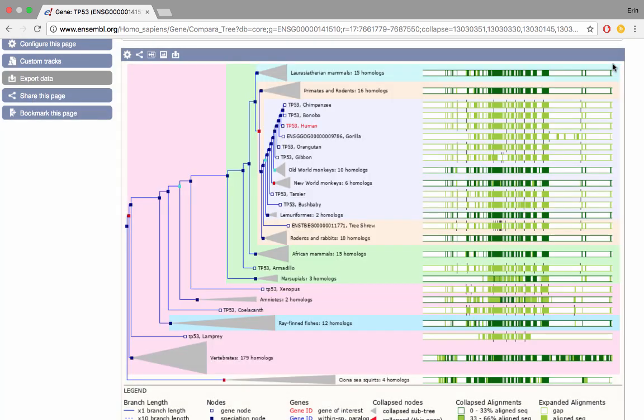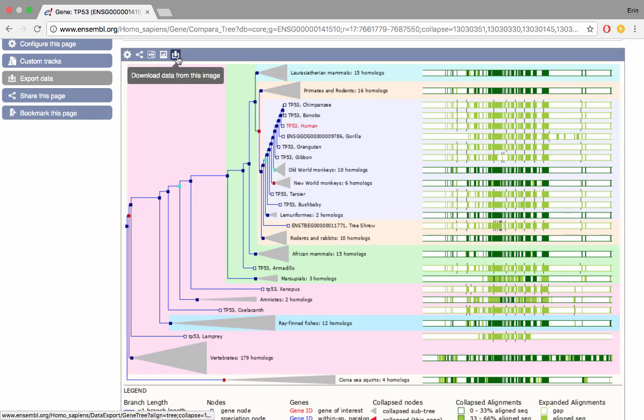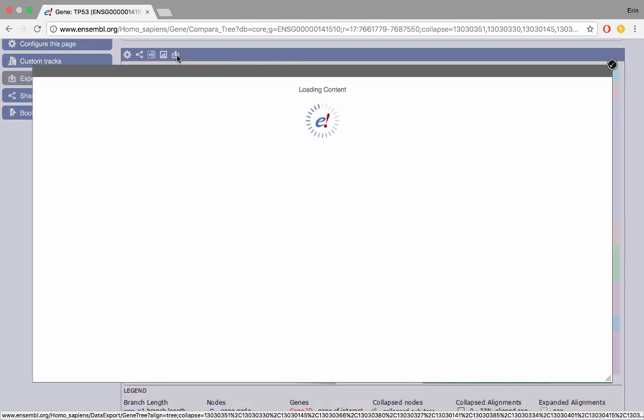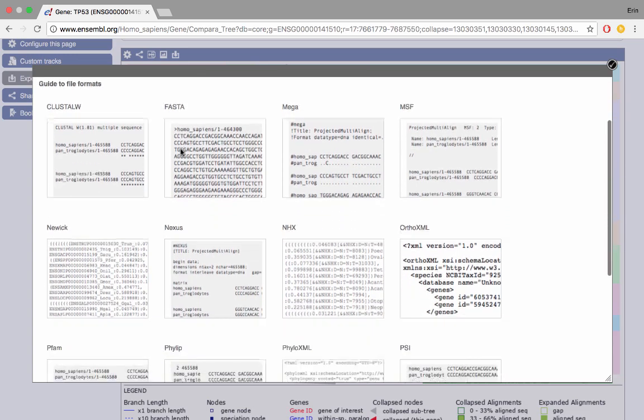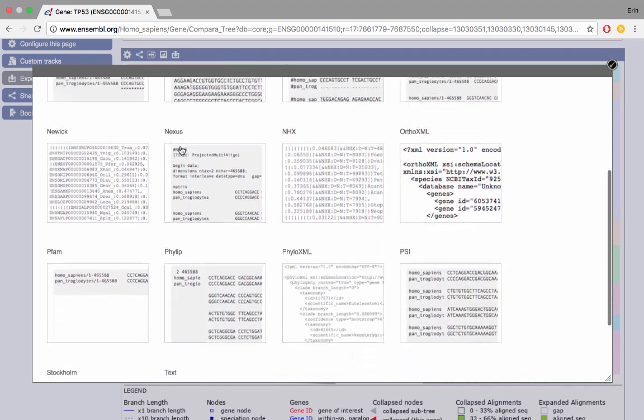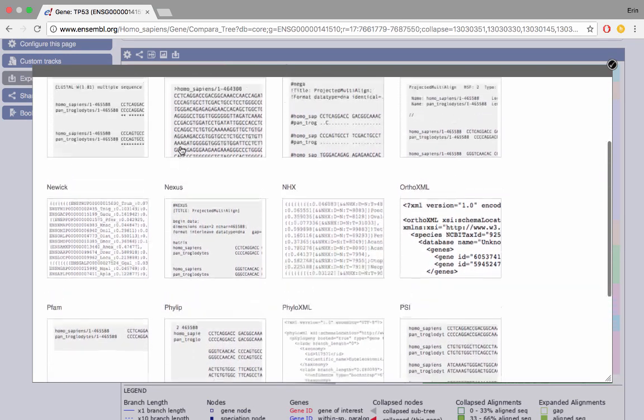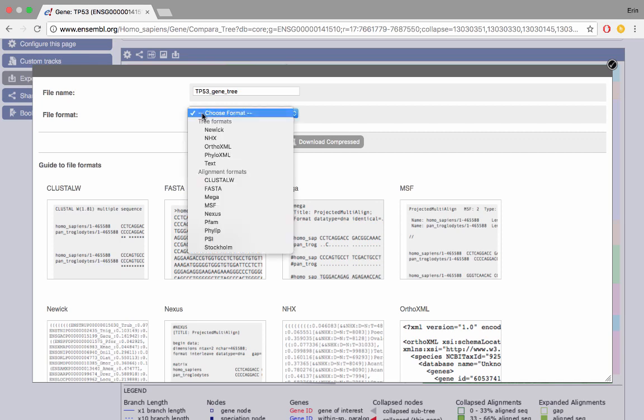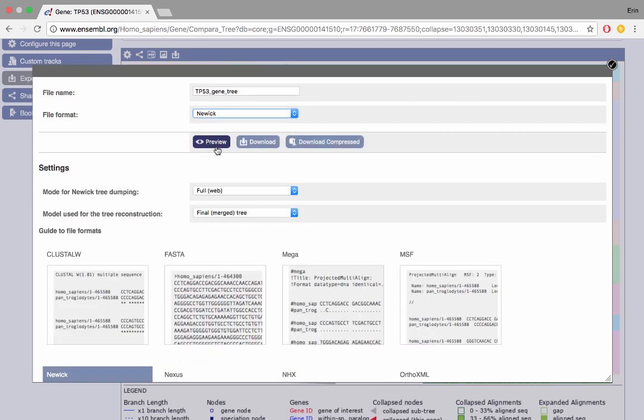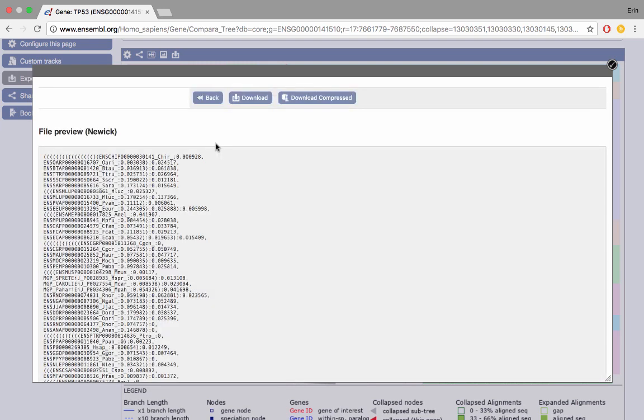The final option is to download the data from this image. If we click on this icon we can see that we have a range of different formats in which we can download this data. What's particularly useful is once you've selected a format that you're interested in, either from the drop down box or by clicking on the image, you can see a preview of that data and you have the option to download as it is or as a compressed file as well.